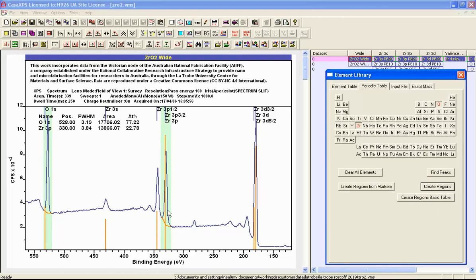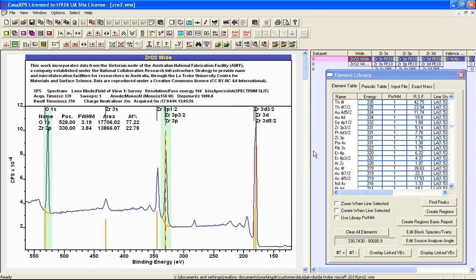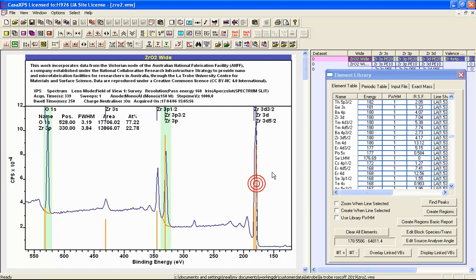The reason that the zirconium 3p doublet is selected is because in this instance the relative sensitivity factor in terms of a photo ionization cross section is the largest out of the possible ones - it's 7.78. We have for the 3d is 7.04, so the criterion by which the zirconium 3p was selected was simply based on the relative sensitivity factor.